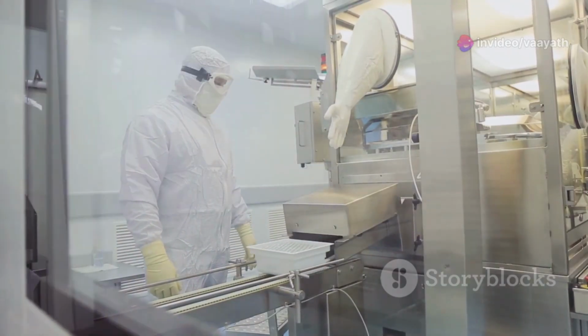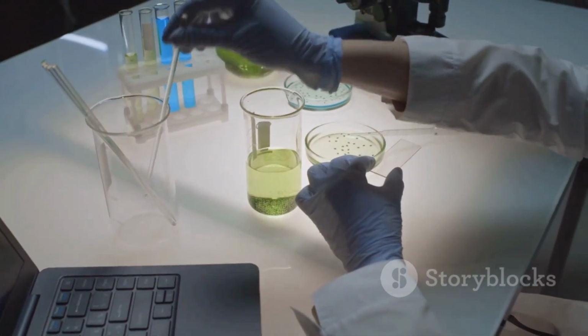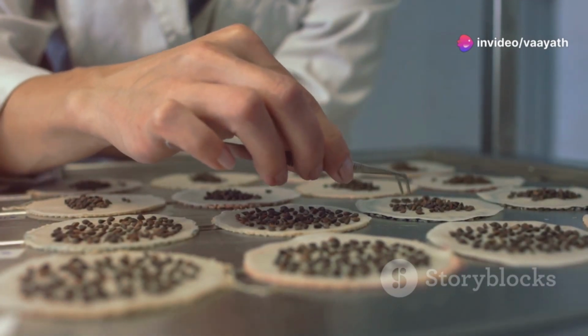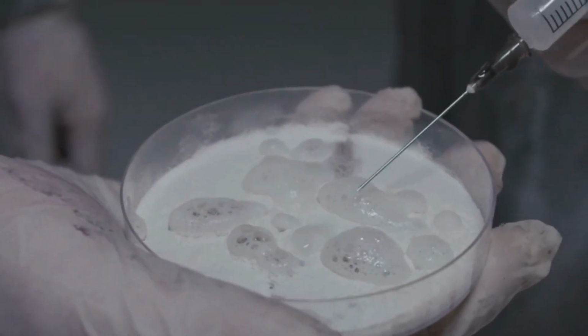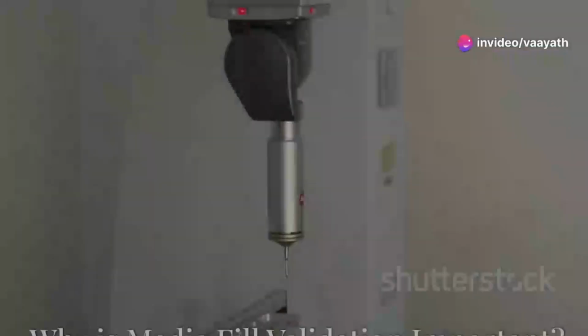Media fill validation simulates the actual drug manufacturing process. However, instead of the real drug, we use a nutrient-rich broth called culture media. This broth acts like a feast for any hidden microbes. If the broth remains clear after incubation, it indicates that the process successfully eliminates contamination. A cloudy broth, on the other hand, spells trouble, signifying microbial growth and a breach in sterility.